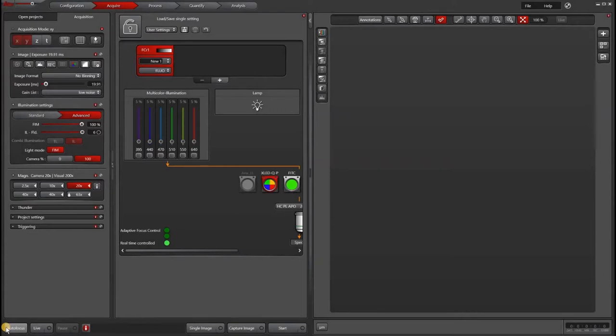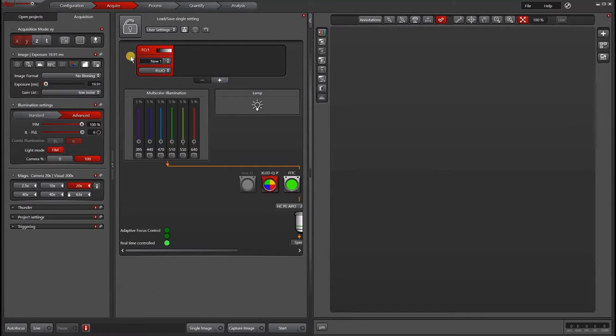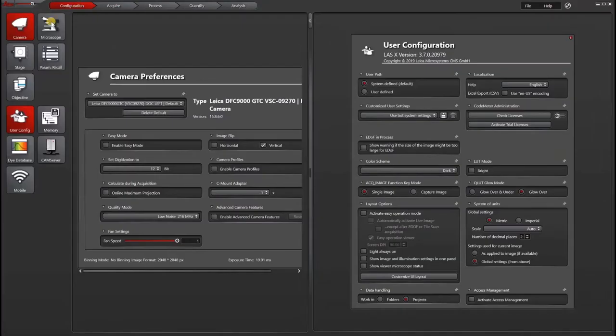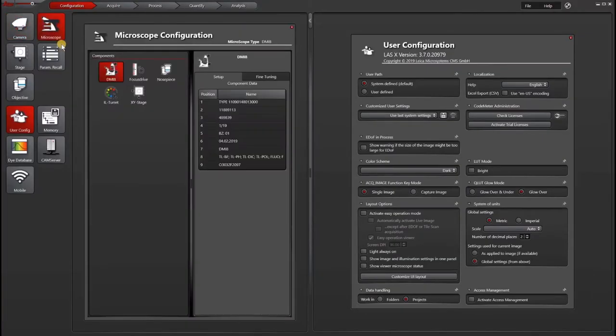So depending on your version of LASX, you may be able to change both your objective lens and your filter cubes within the software without going to hardware configurator. To do that, go to configuration, then go to microscope.